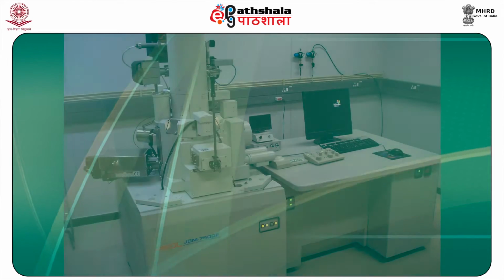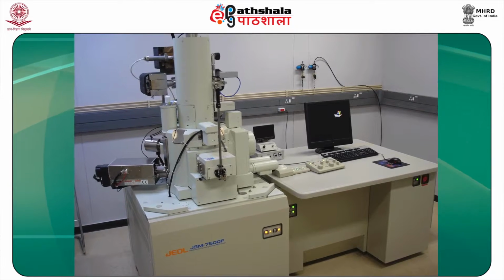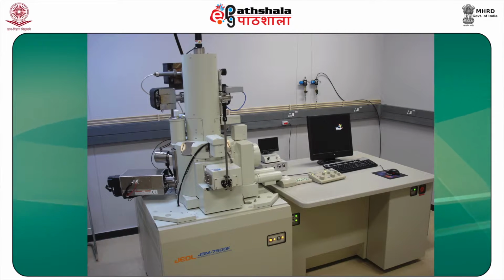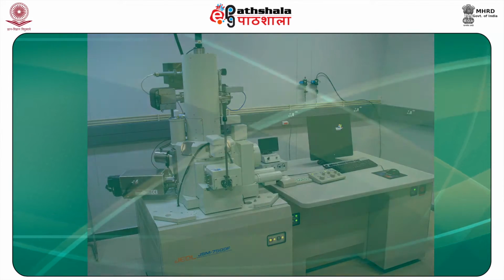There are many advantages of using the SEM instead of a light microscope. Using SEM provides a large depth of field, which allows a large area of the sample to be in focus at one time. A scanning electron microscope converts the emitted electrons into a photographic image for display. This affords high resolution and depth of focus.